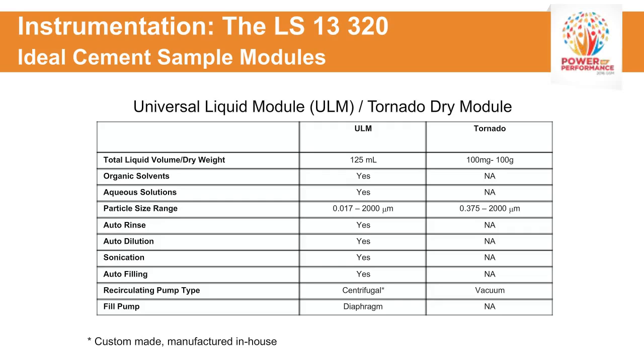On the dry side, the amount of sample one uses is based primarily on the size distribution. You typically like to add enough powder to run about 20 to 30 seconds. This should give you a very good representative sample. So that would typically be your run time.